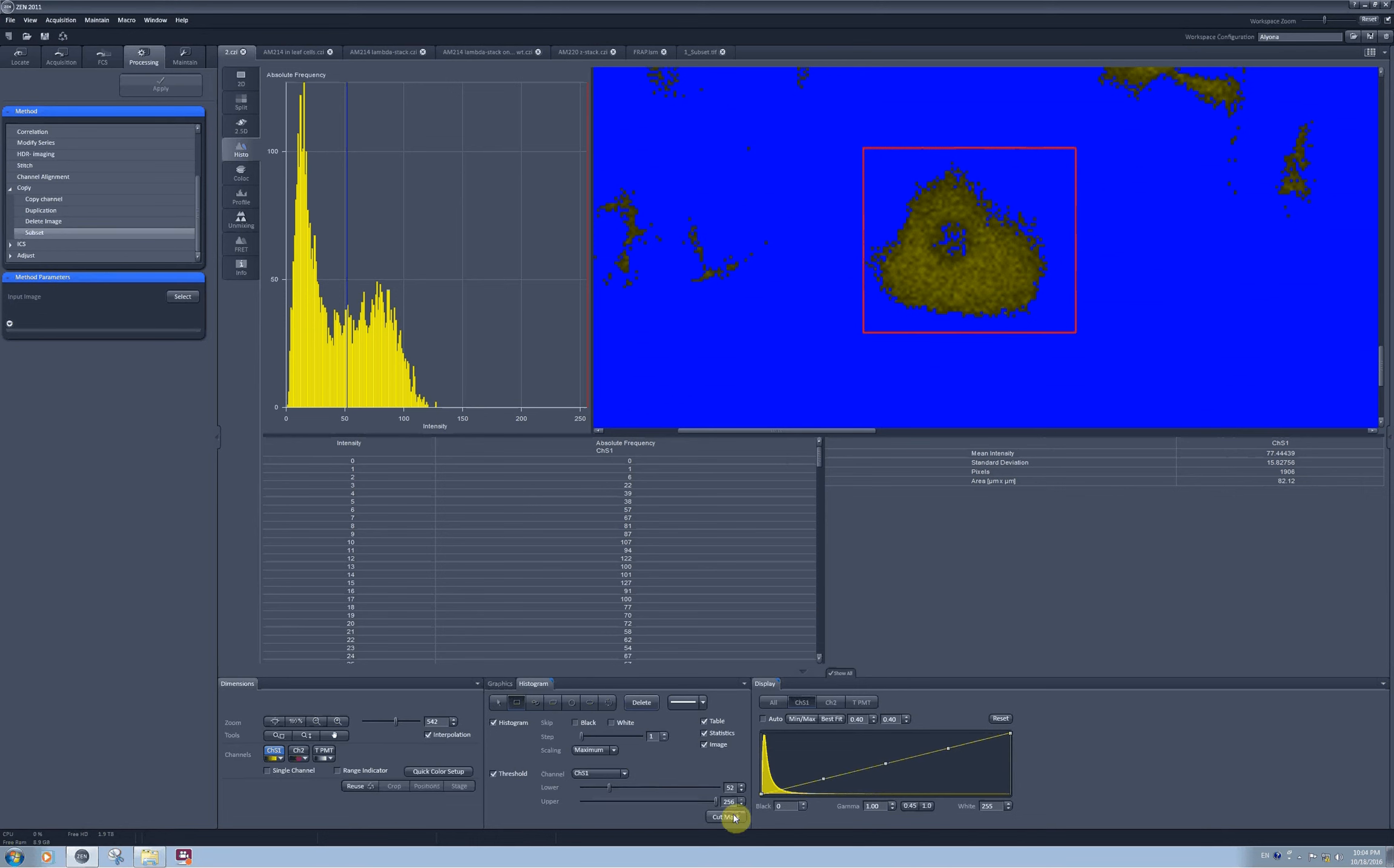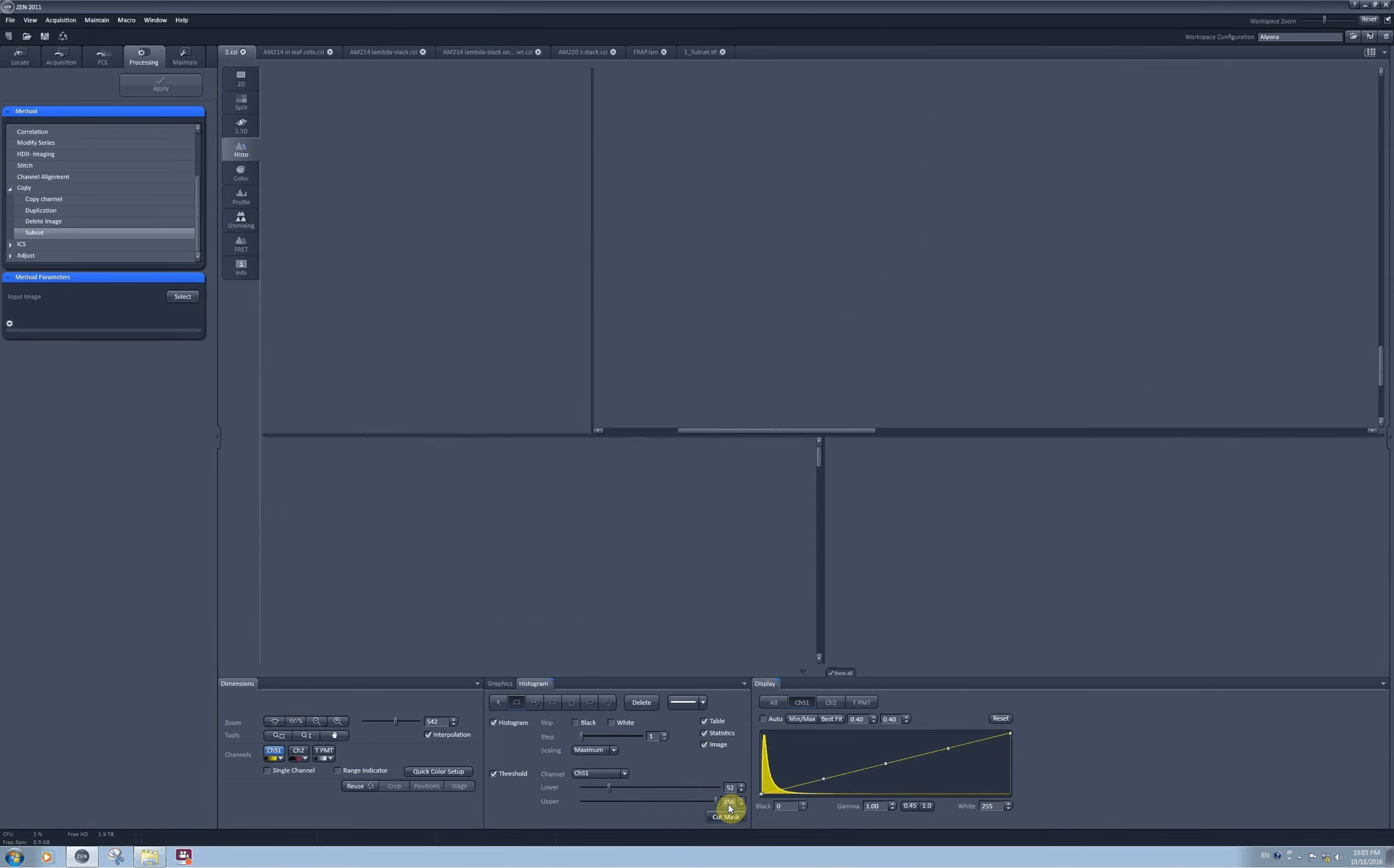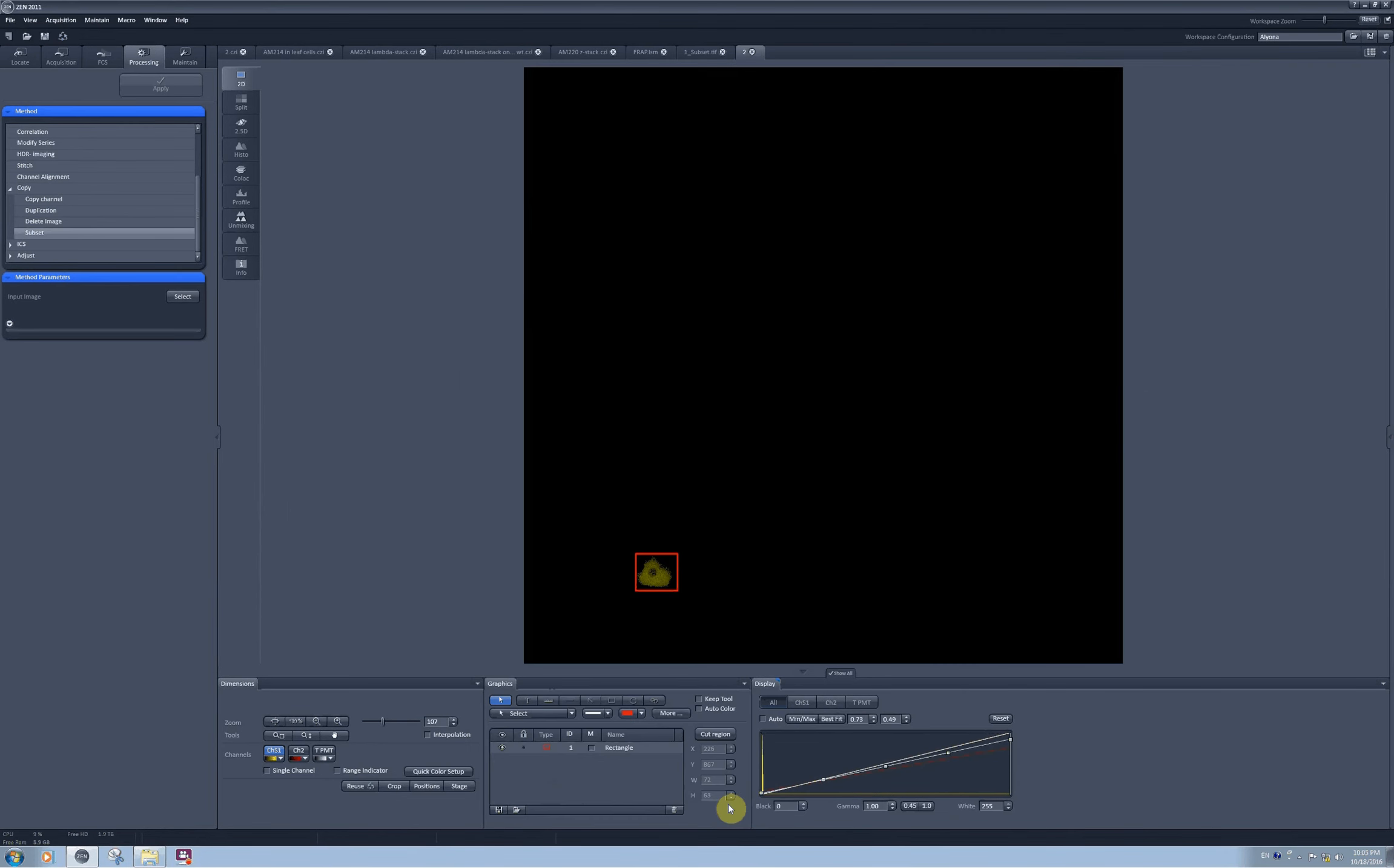You can also create a mask for your selection if you would like to present it as an image for publication later on.